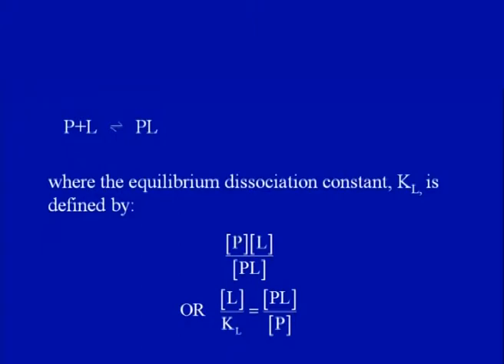So, these things need to be taken care of when you are choosing the size of the ligand. Now, affinity, like I said, the interaction of a protein, say P, and ligand L can be described in this way: P plus L equilibrates with PL, and the dissociation constant could be given by this equation here.